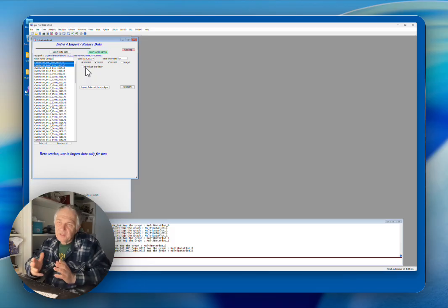There are a few other things which need to be changed or may need to be changed for various of these steps. So the reduce data checkbox here, while it's active, I strongly discourage anyone from using it. And that's about it. So that's a new tool. It makes life of users of the USAXS instrument significantly easier.